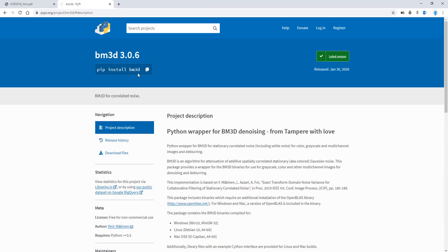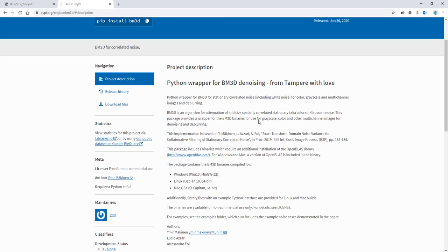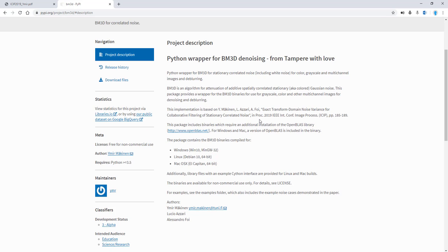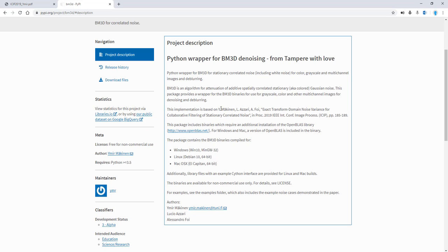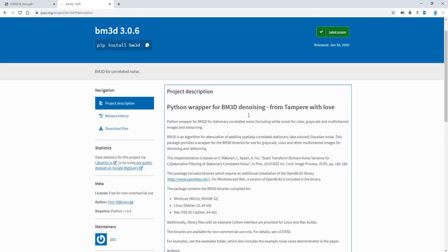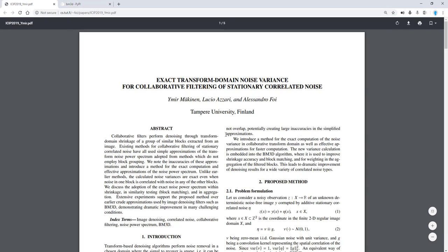Let me open up the PyPI page and go ahead and pip install BM3D here. As of today, February 2020, in fact the latest version was January 30, 2020, so this is very actively maintained. It's based on the publication by this group, Makinen. I apologize if I said that the wrong way. This paper was published in 2019, so this is quite recent.